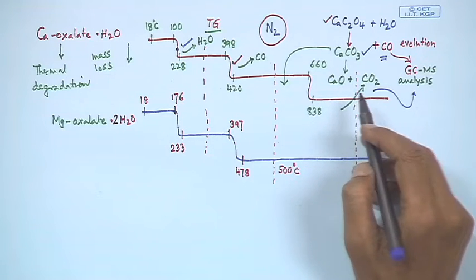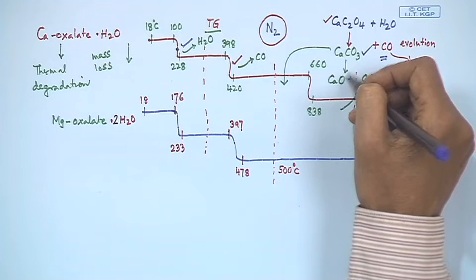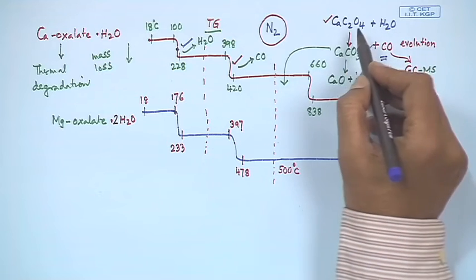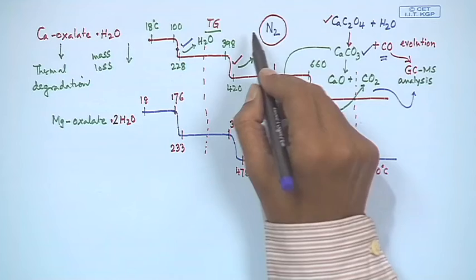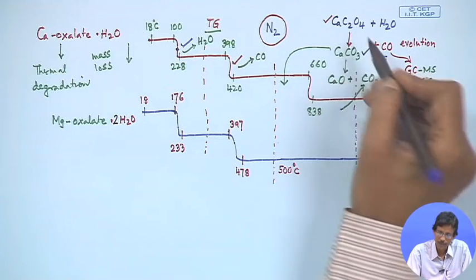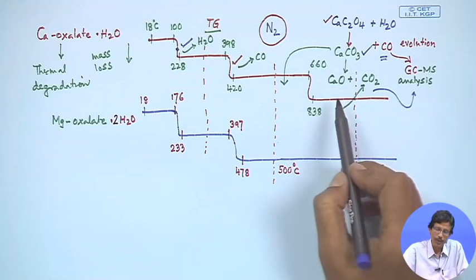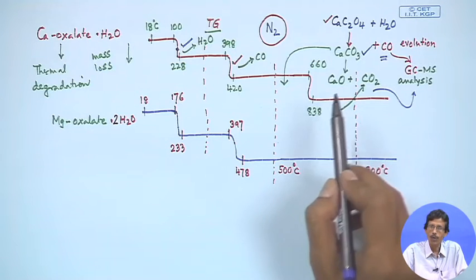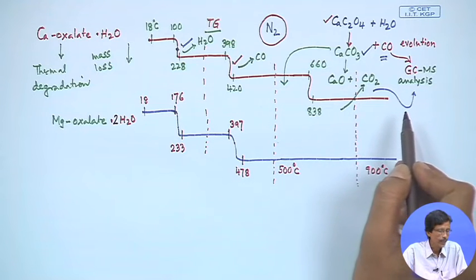So, the furnace is heating and driving the corresponding conversion, but the balance present in this thermogravimetric analyzer is taking the weight. In one case it is the weight of the hydrated form. So, the hydrated form is sample A, this is sample B, this is sample C, and this is sample D. That is a very useful and very good example of the conversion of a calcium-bearing compound, from A to B, B to C, and C to D.